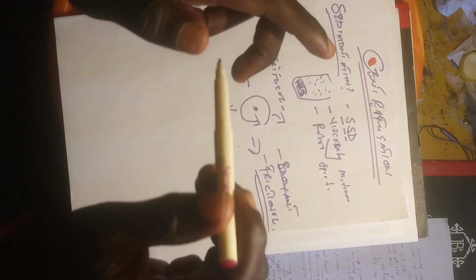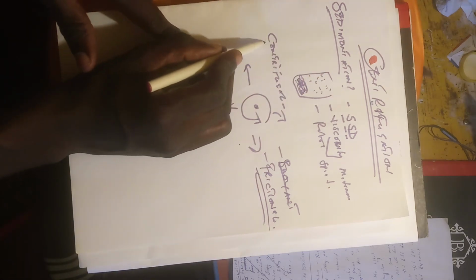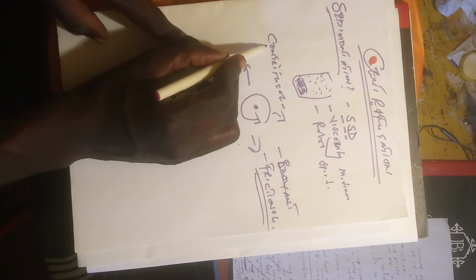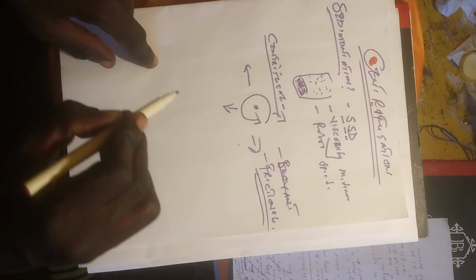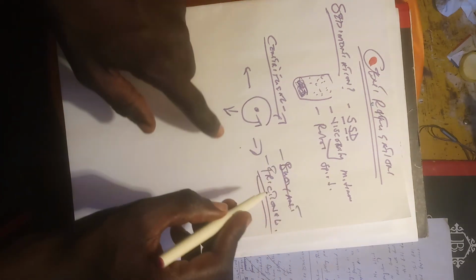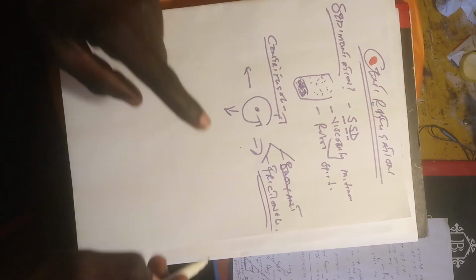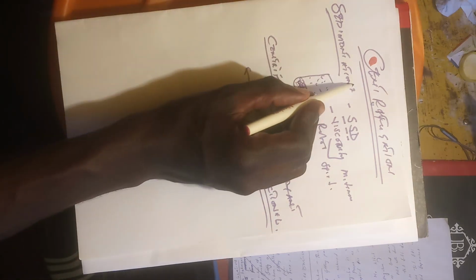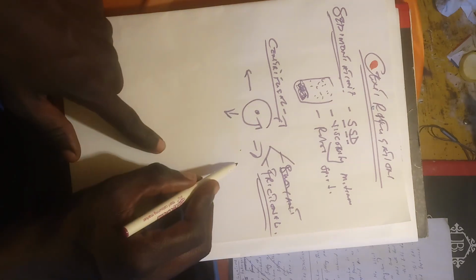So in centrifugation, when particles are subjected to a centrifugal force, and the centrifugal force exceeds these two forces, the buoyant and frictional force, then particles will finally sediment or settle.